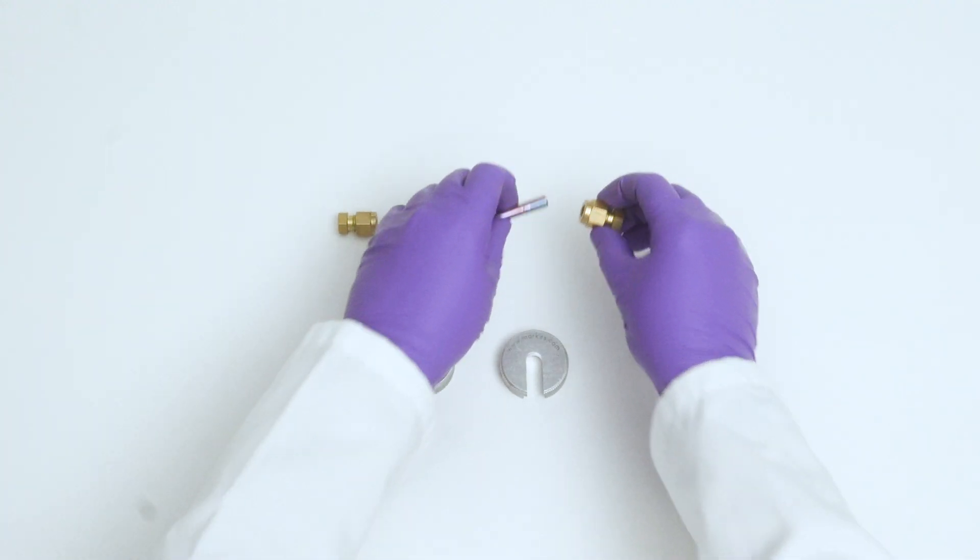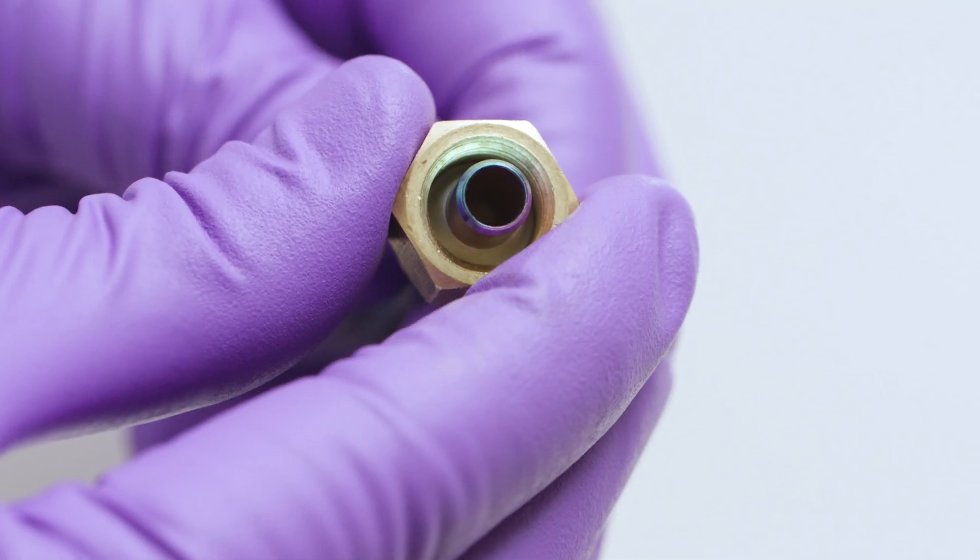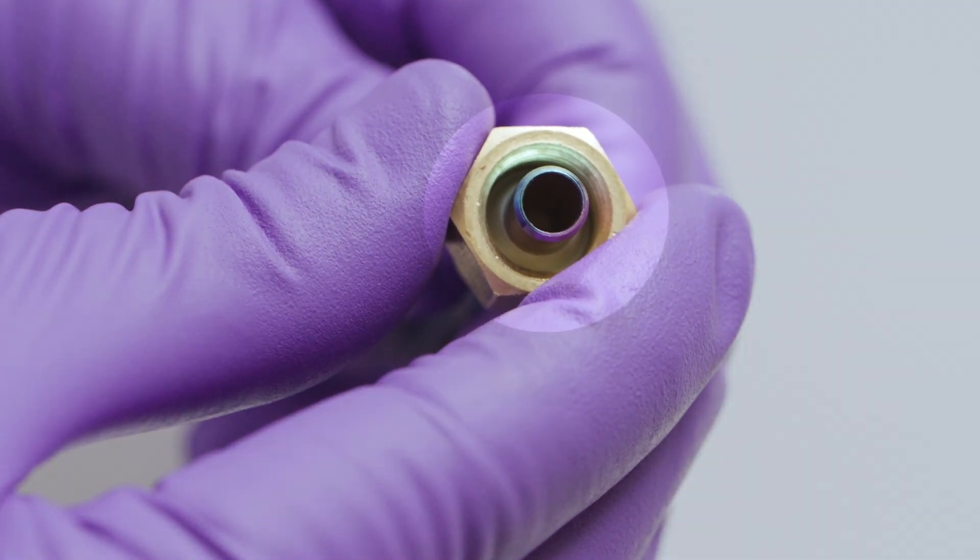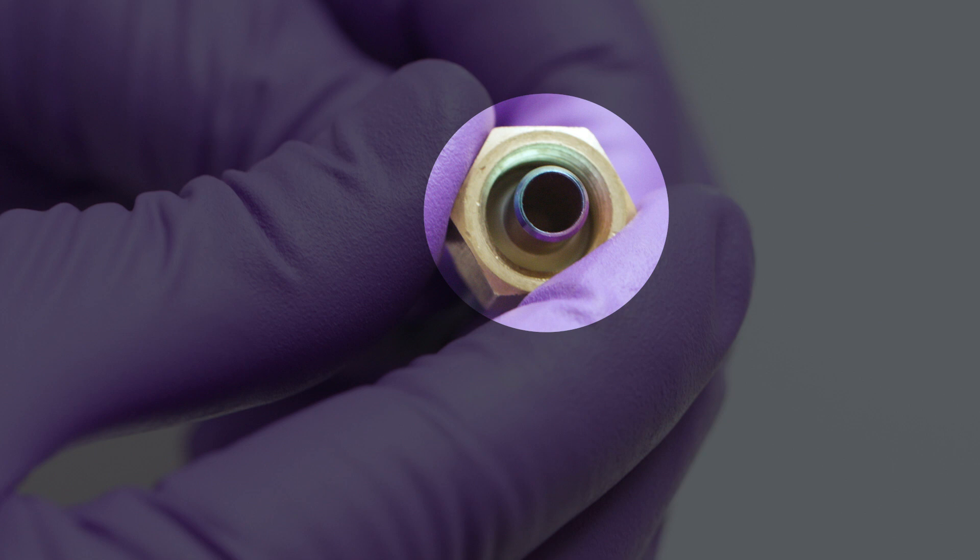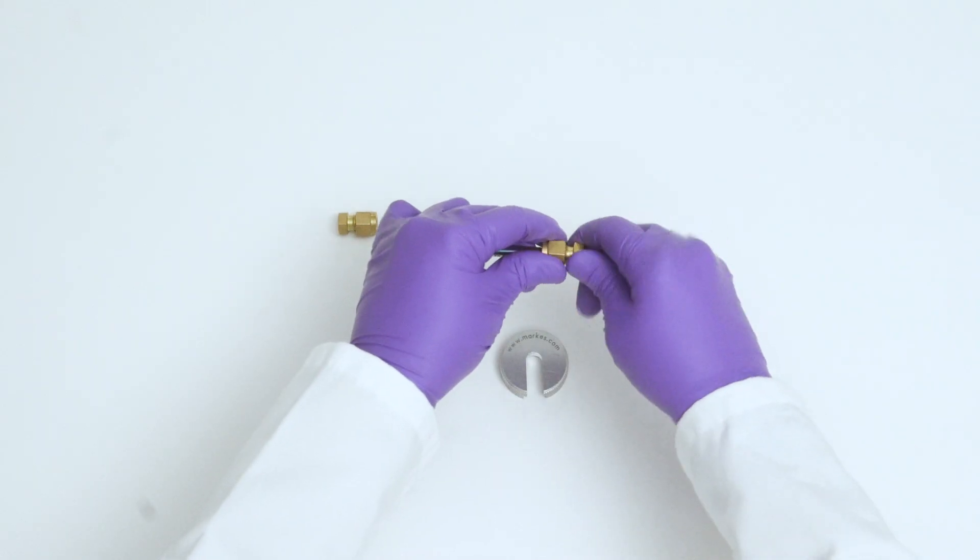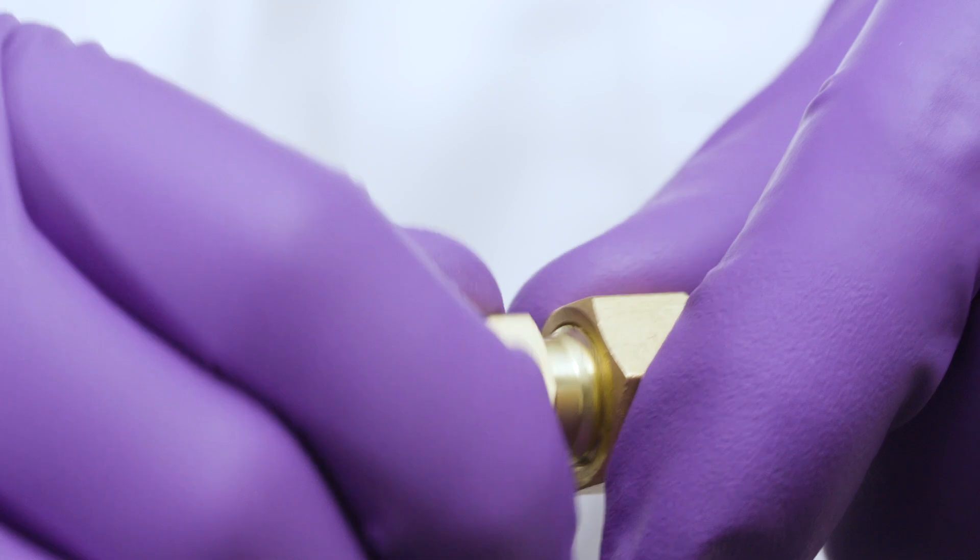Before using the cap lock tool, fit the long-term storage caps onto the tube, ensuring the tube passes through the PTFE ferrules within them. You should finger tighten the caps as securely as possible.